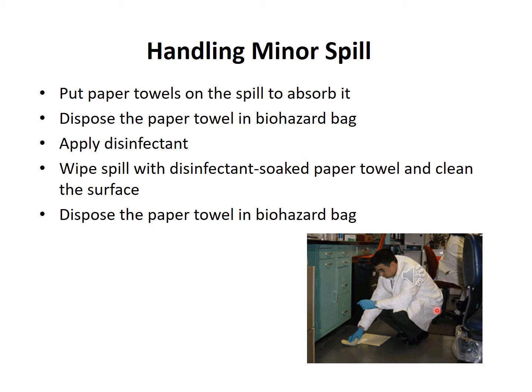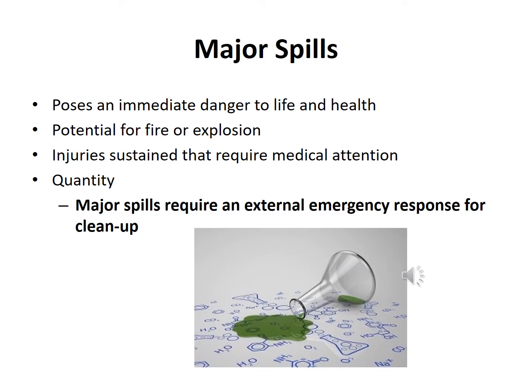So minor spillage is very easy to handle, and every student and every worker can do this minor spillage cleanup whenever they face this problem. Regarding a major spillage, this is of course more dangerous because it can pose a serious threat to the life of the worker.